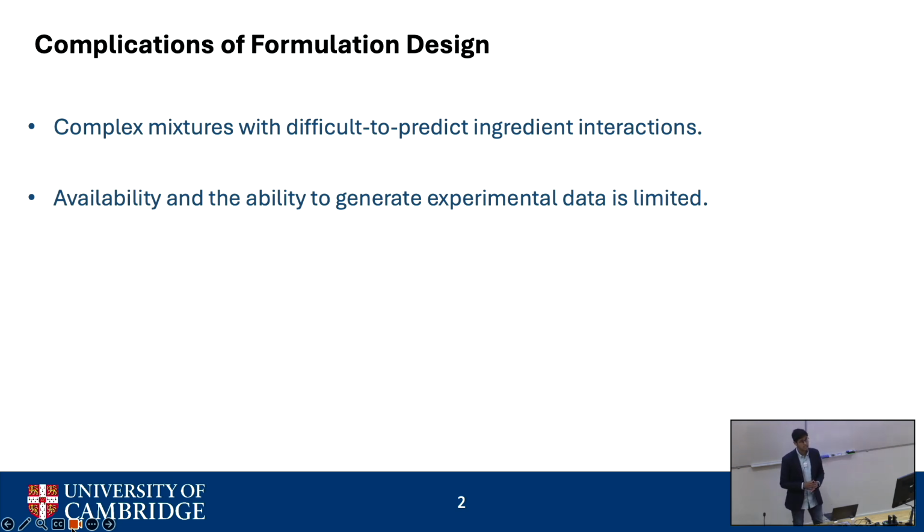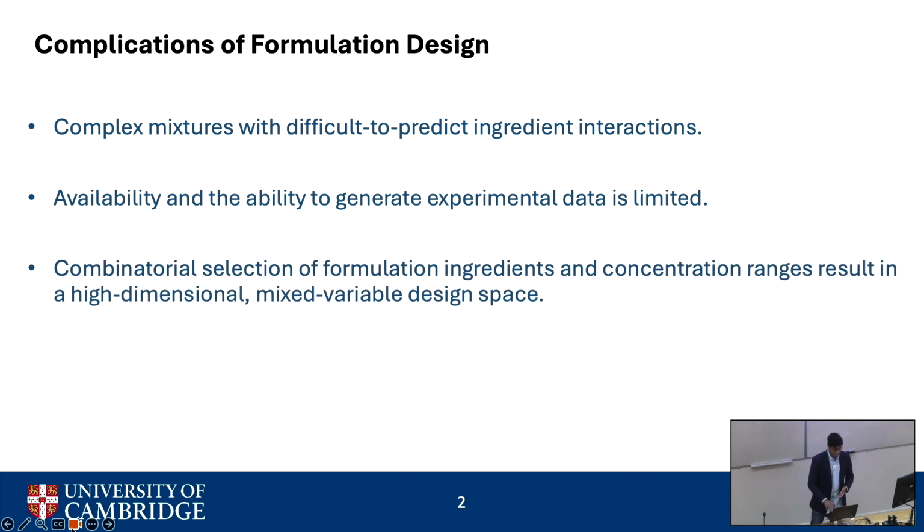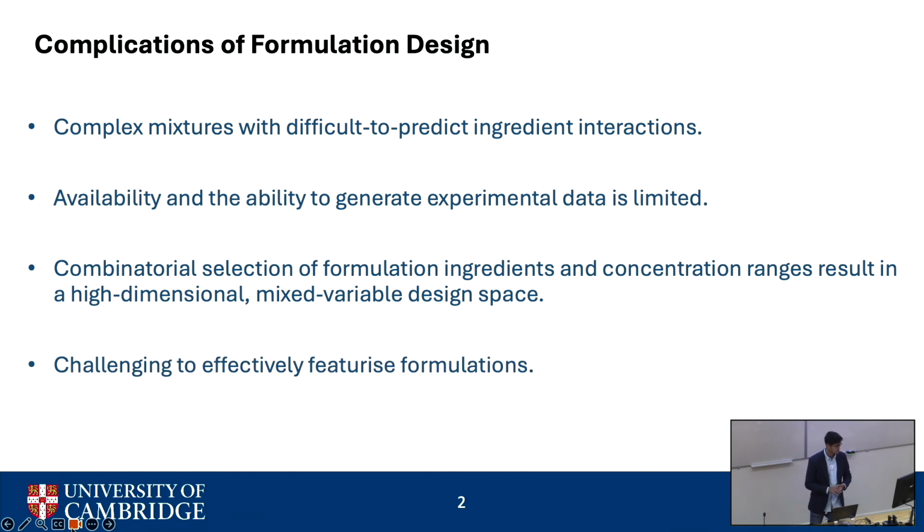Now, in formulations development, you have traditionally lengthy and manual characterization or processing steps, so there were several hurdles to be overcome here. Now, once we're able to perform the experiments, we still have a very vast experimental design space. So our experimental budget is relatively limited in relation to the space we want to screen. Therefore, this leads to the question of how do we select which experiments to perform? And this was another chapter of my thesis.